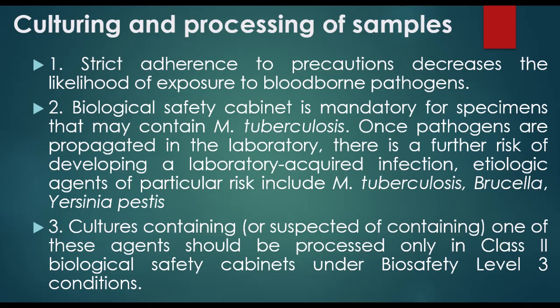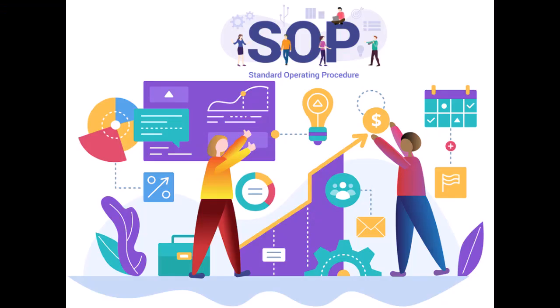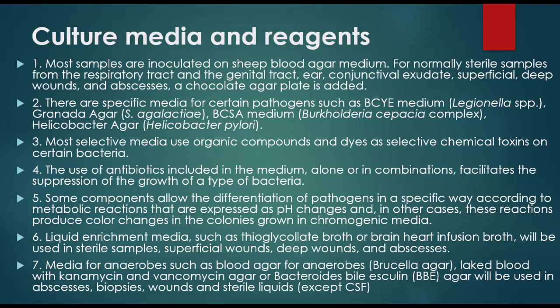Use of a biological safety cabinet is mandatory for specimens that may contain Mycobacterium tuberculosis. Once pathogens are propagated in the lab, there is a further risk of developing a lab-acquired infection. Etiologic agents of particular risk include Mycobacterium tuberculosis, Brucella, and Yersinia pestis. Cultures containing one of these agents should be processed only in Class 2 biological safety cabinets under Biosafety Level 3 conditions, and the SOP should be followed according to the organisms and cultures.